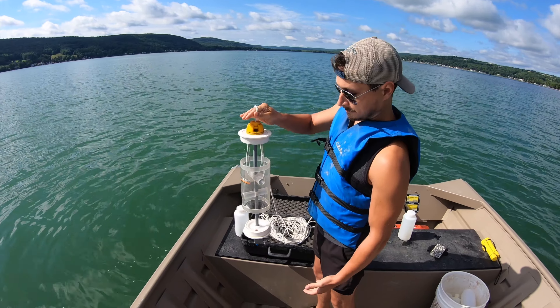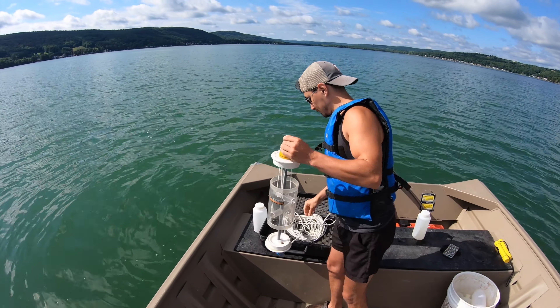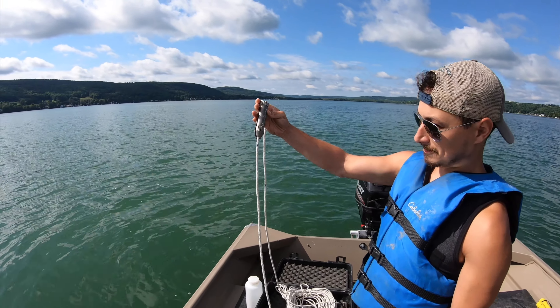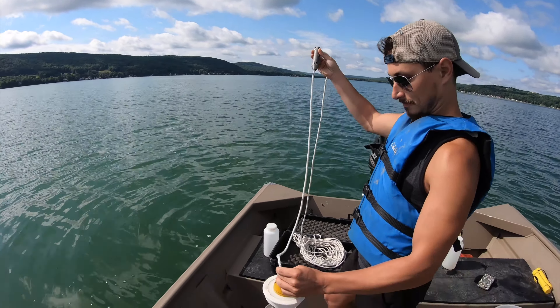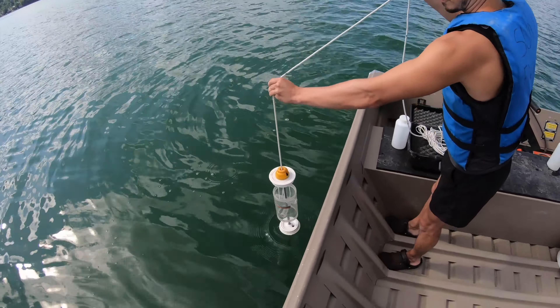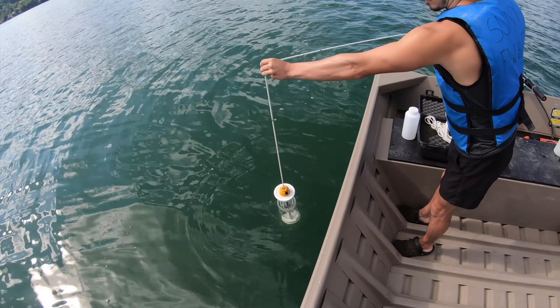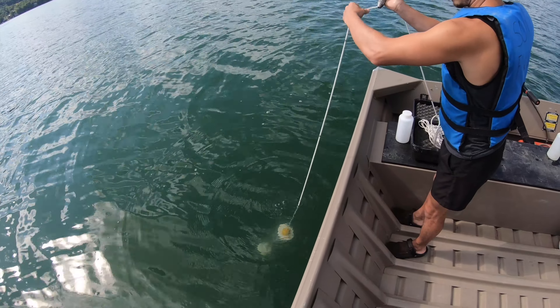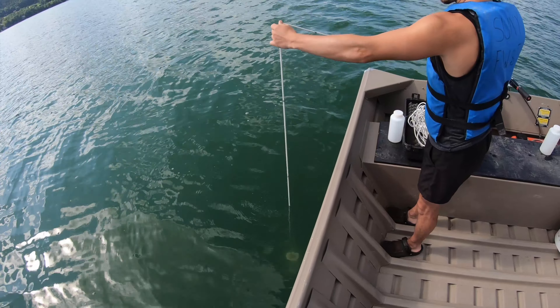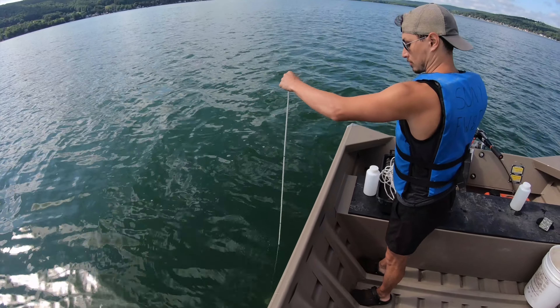Make sure that it's not going to close, and Matt's going to send it down. He has a piece in his hand called the messenger. He's going to hold on to that while he sends the Kemmerer bottle down to the bottom. He's going to send it straight down. We're about 39 feet here. There are tick marks on the rope to make sure that we don't hit the bottom.